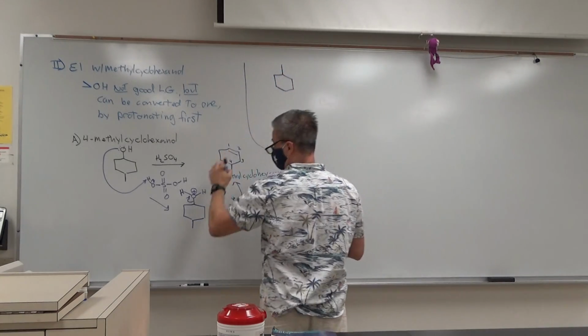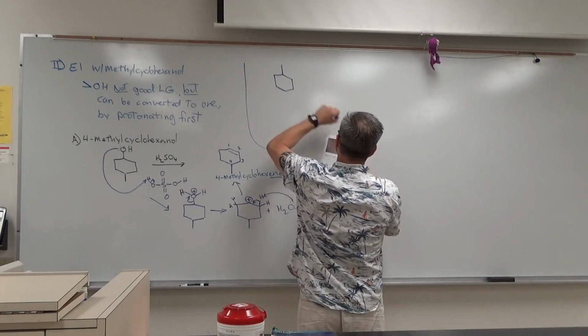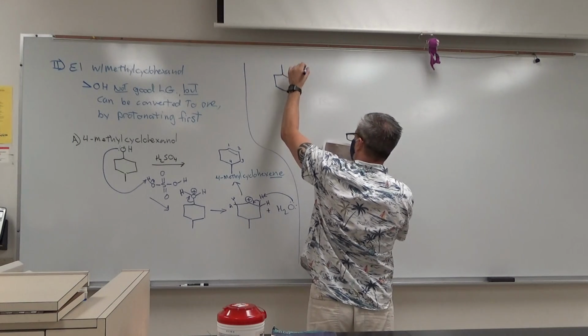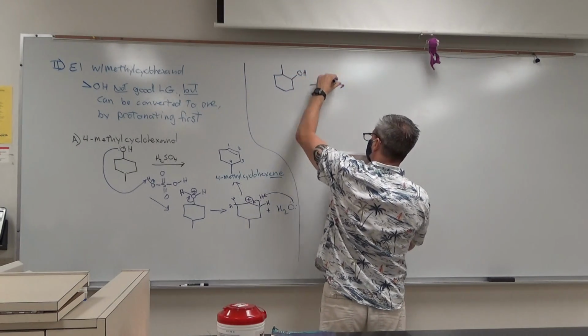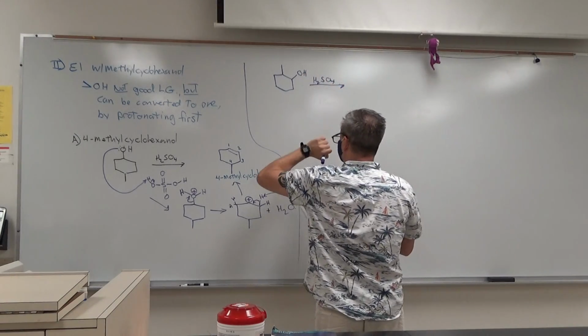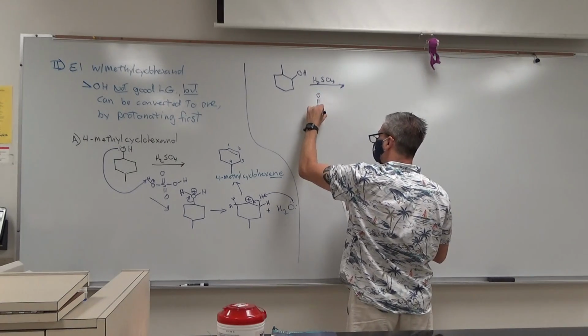All right, so like I said, some of you are going to use this guy, the 4-methylcyclohexanol. And some of you are going to use 2-methylcyclohexanol. All right, so same mechanism.